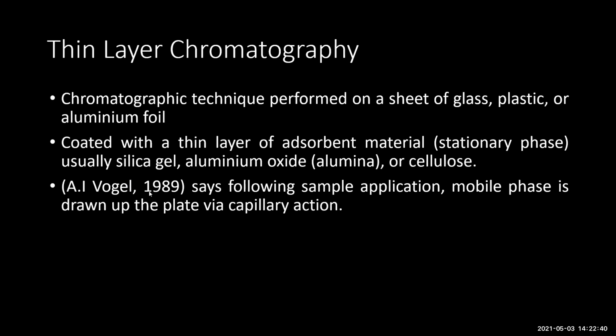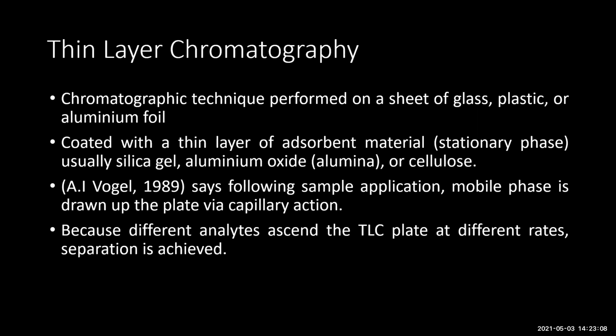Okay. So in 1989, A.I. Vogel said, following sample application, the mobile phase is drawn up the plate via capillary action. So this person, A.I. Vogel, in 1989 gave us the principle behind how thin layer chromatography works. By this we can see it is quite a recent methodology. It's not very old. He says once the sample is added, the mobile phase is drawn up the plate by capillary action, same as paper chromatography.